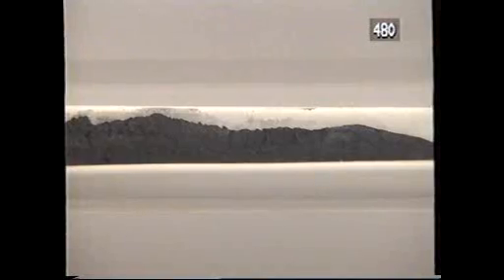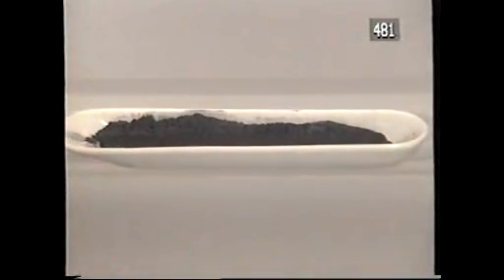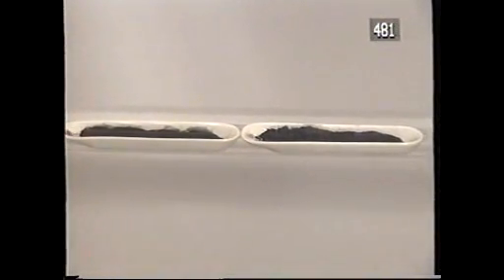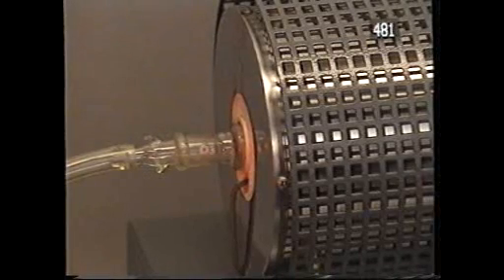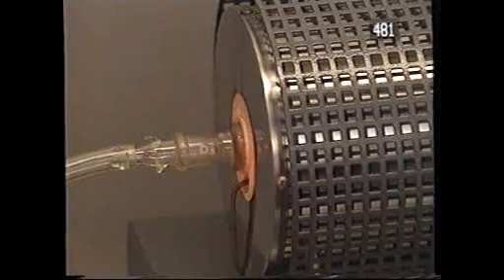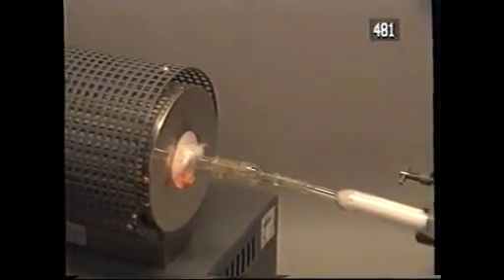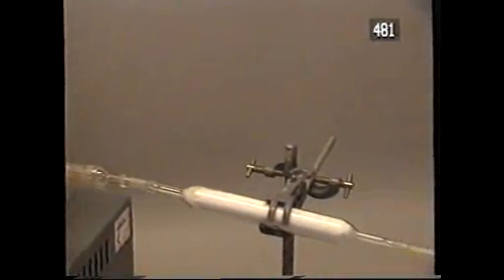But it isn't the only gas which can be made from carbon and oxygen. I can show you that by passing carbon dioxide over very hot carbon. It's this carbon that's going to react with the carbon dioxide. I want plenty of it, so I'm going to use 2 boats. The tube is made of silica because it's going into a high temperature furnace. The reaction goes best at about 1000 degrees Celsius.